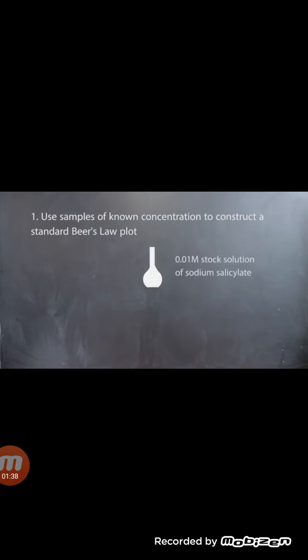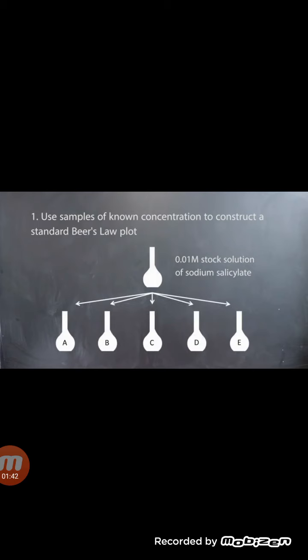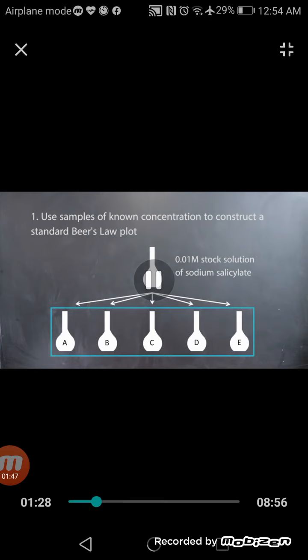First part of this experiment, you will make a 0.01 molar stock solution of sodium salicylate and use that stock to make 5 standard solutions, A through E, which will be analyzed using the Spec 20.